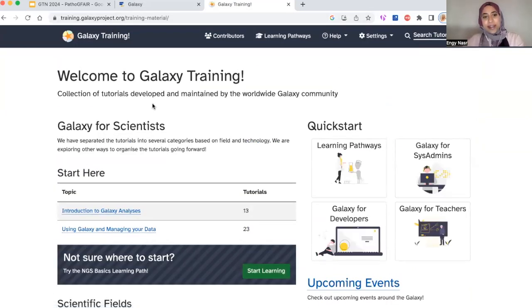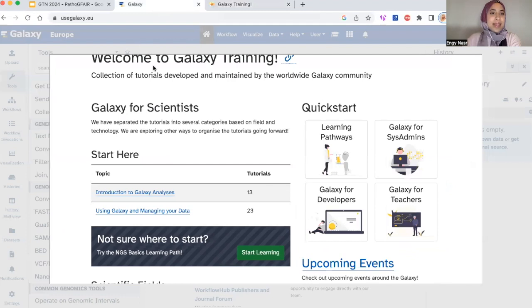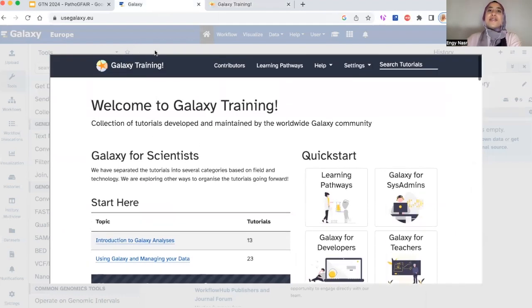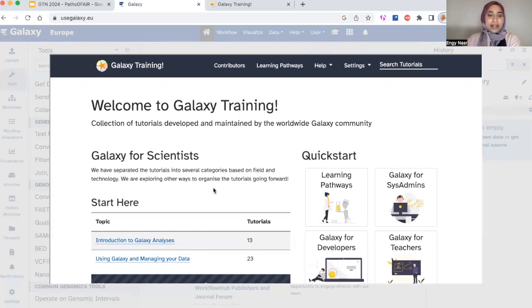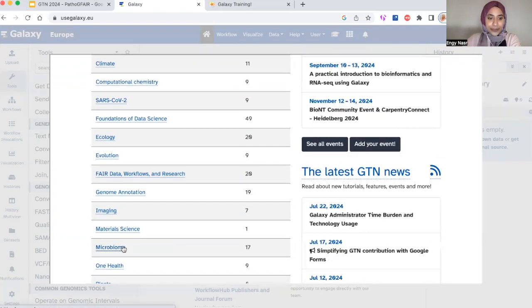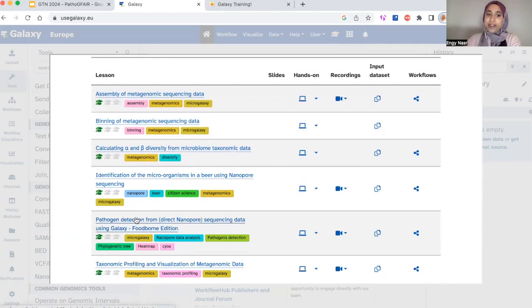Hello everyone, this is Indi Nostre, a PhD student at the University of Freiburg Galaxy team. Today I will be guiding you through one of the Galaxy Training Network materials for pathogen detection using food samples. You can reach the training either through the Galaxy Training Materials website or through your user account on any of the Galaxy servers. You can find it under the Galaxy Training Materials section and navigate to microbiome, where you'll find our training under the name 'Pathogen Detection from Direct Nanopore Sequencing Data Using Galaxy - Foodborne Edition'.